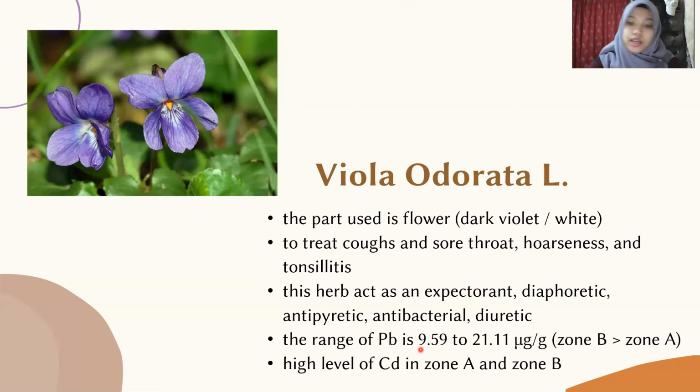Okay. The heavy metals like Cu, zinc, nickel, cobalt, and iron, when tested, were found to be under the prescribed limit which has been set by the WHO.